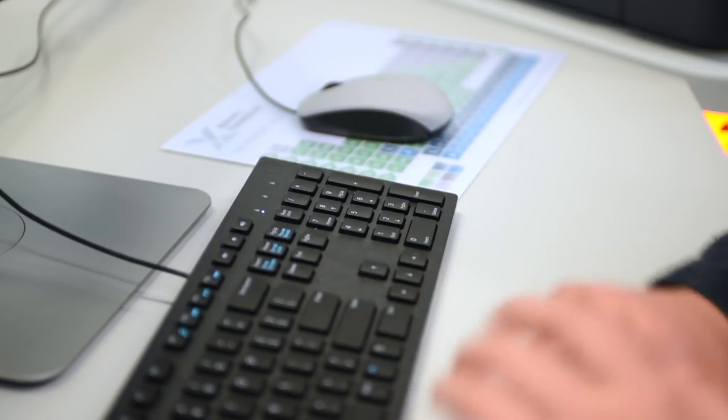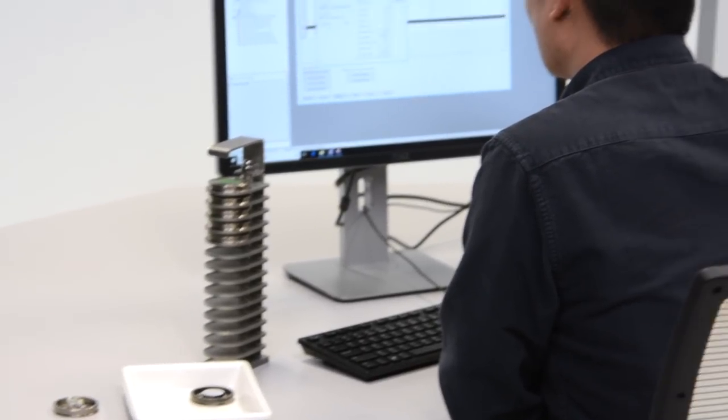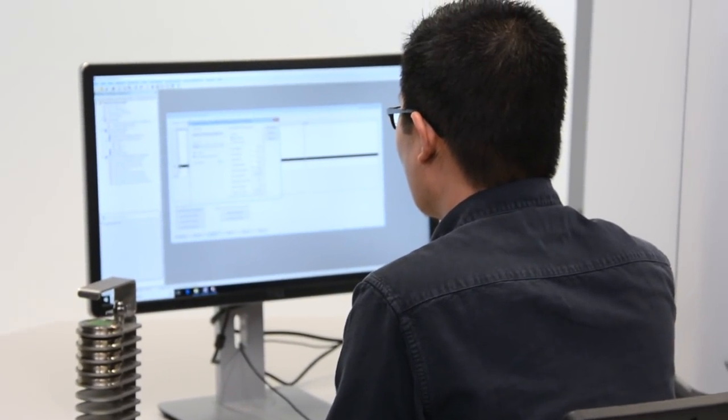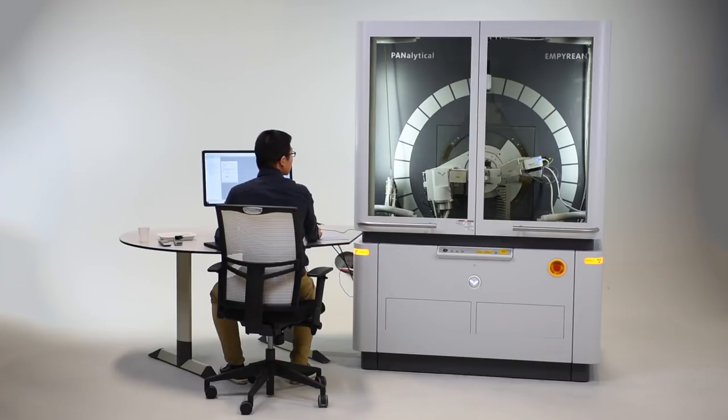Training new students to become proficient with more advanced x-ray applications is now much simpler because there is no need to exchange expensive x-ray optics.